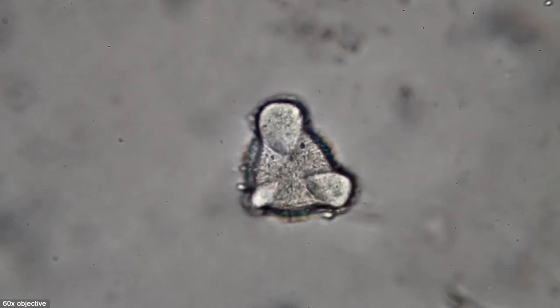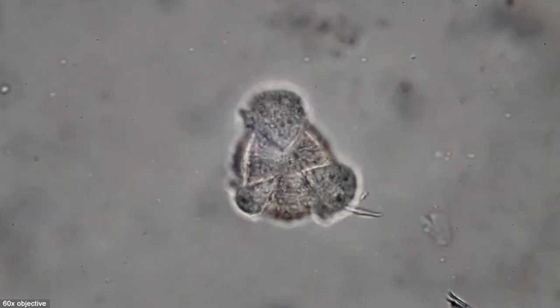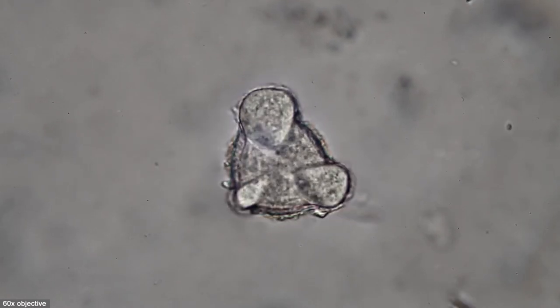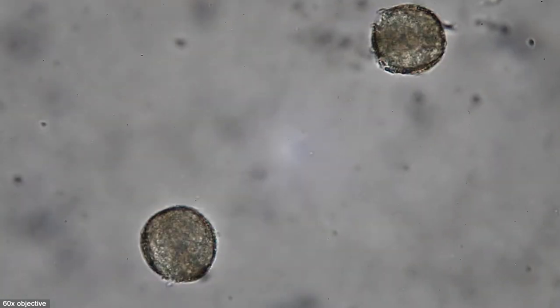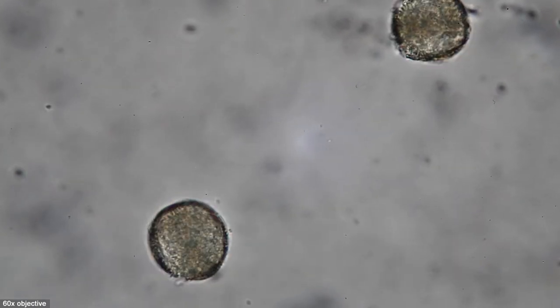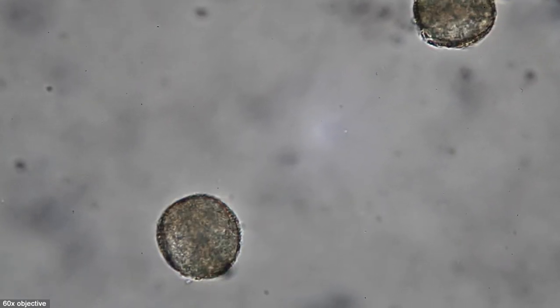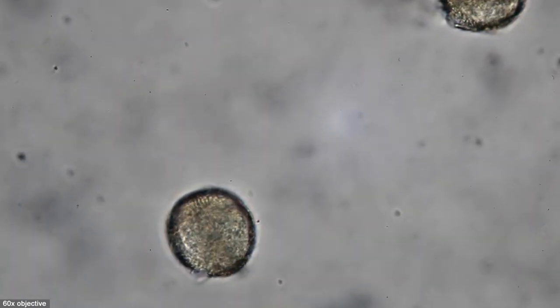I'm just more fascinated in observing nature, but I don't really know much about the pollen identification. It's a pretty advanced topic anyway. So that should have given you a short insight into the different pollen from honey.